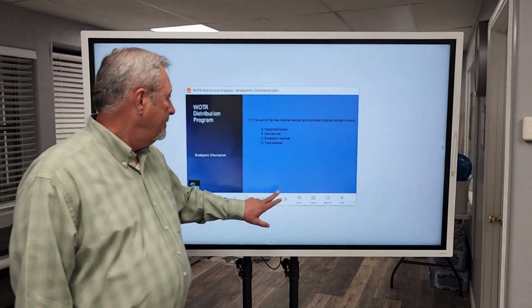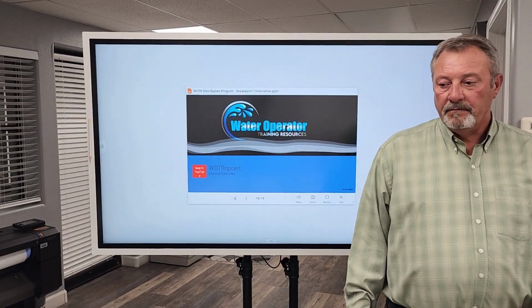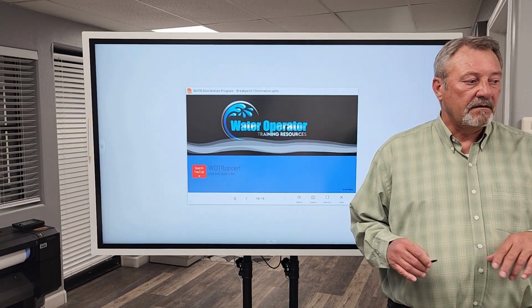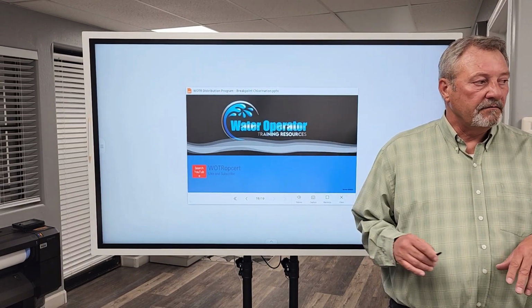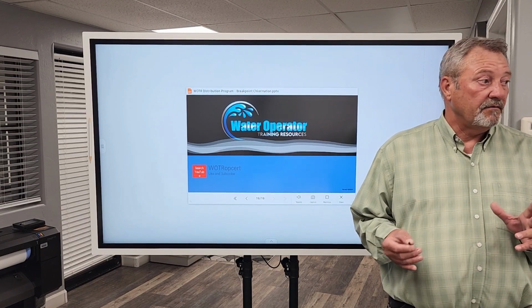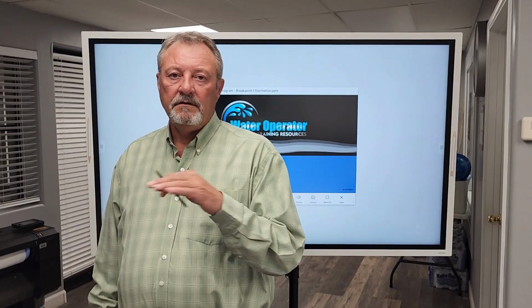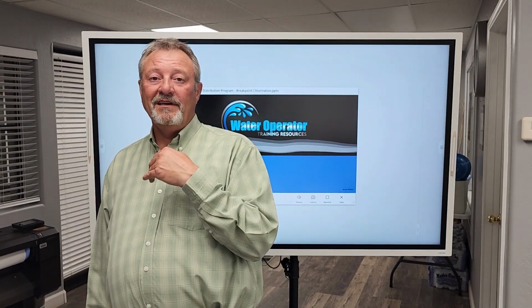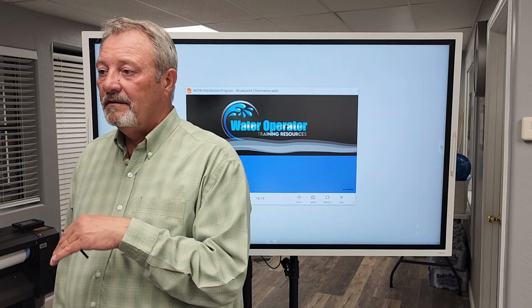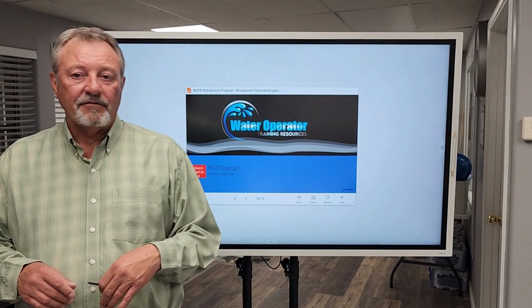And that's it. Thank you, fellas. For this last page right here, we'll get together and go over the breakpoint curve. Probably tomorrow. It shouldn't take very long, but I want to make sure that everybody gets to see it. Folks that are watching the video, you'll see it at the beginning, or near the beginning, along with an example of using DPD to check for chlorine residuals.